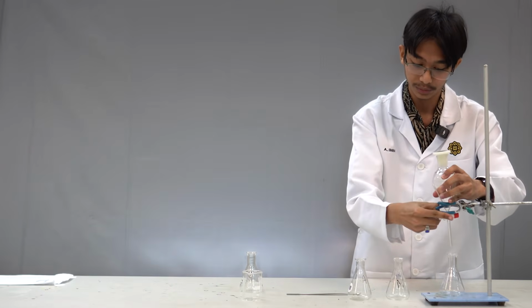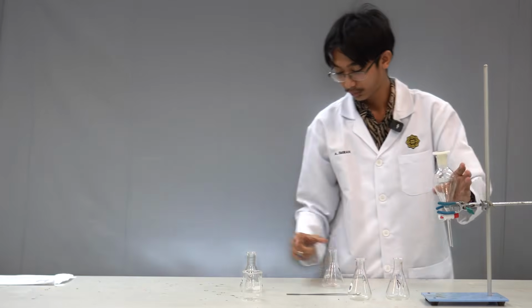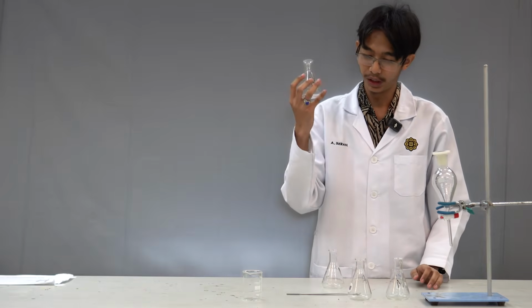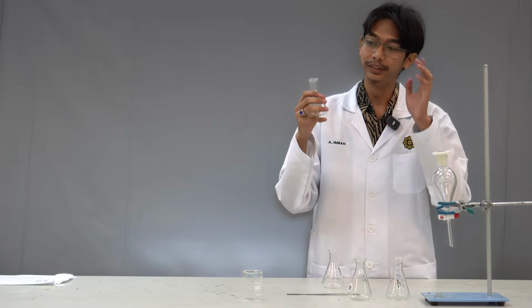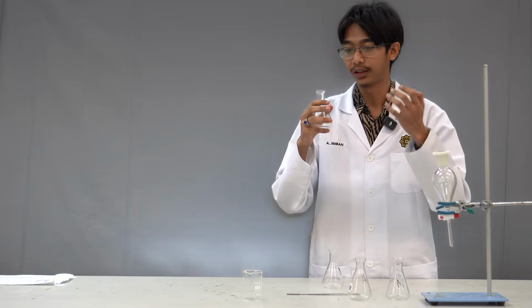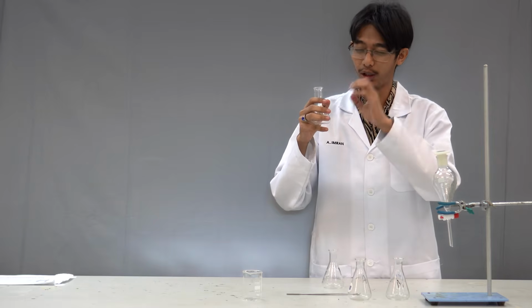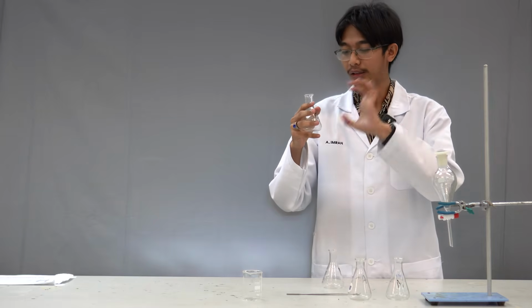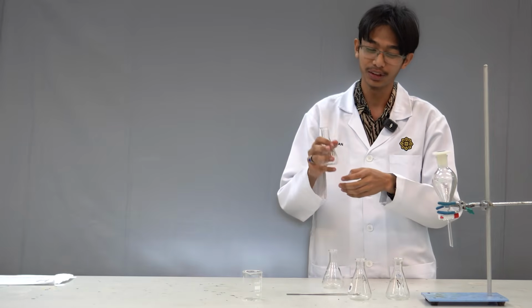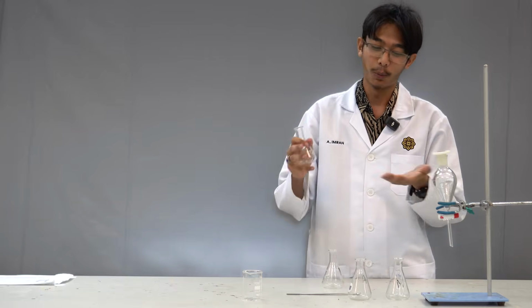When you empty it out, you also have to take into consideration, for the mixture flask, are you sure that it's going to be 100% extracted of your acid? Acid is 100% extracted from this mixture. Ideally, you want to say yes, but come on, we live in the real world.